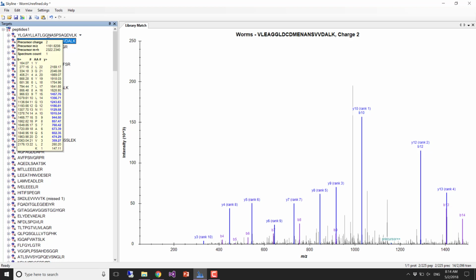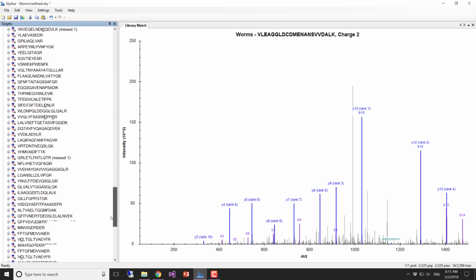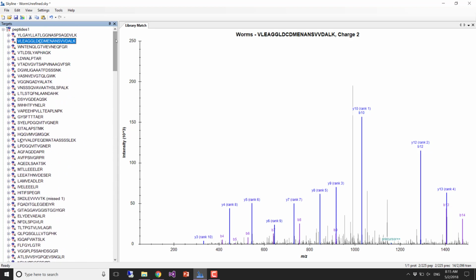This was back in like 2008, 2009, and we were unsure whether you could use data from an LTQ to choose transitions for SRM. Our lab does a lot of C. elegans research, so we took a spectral library that we had and took a whole bunch of peptides from it, probably just a worm lysate or something, and tried to measure all these transitions.